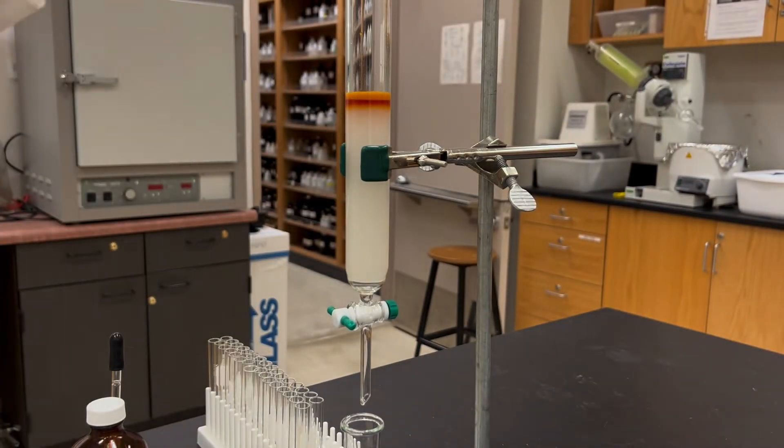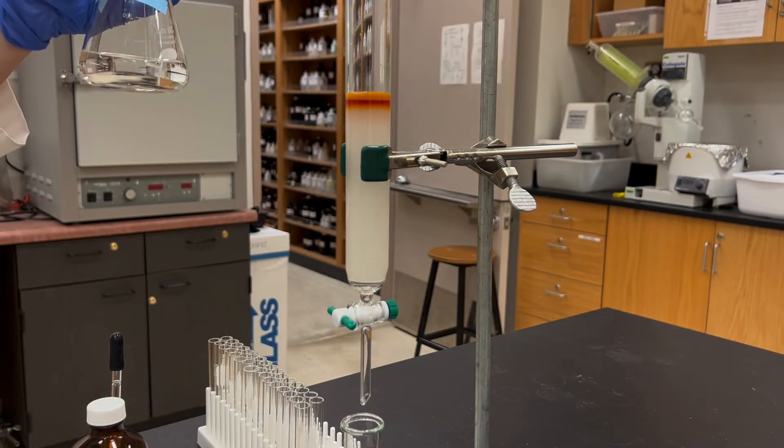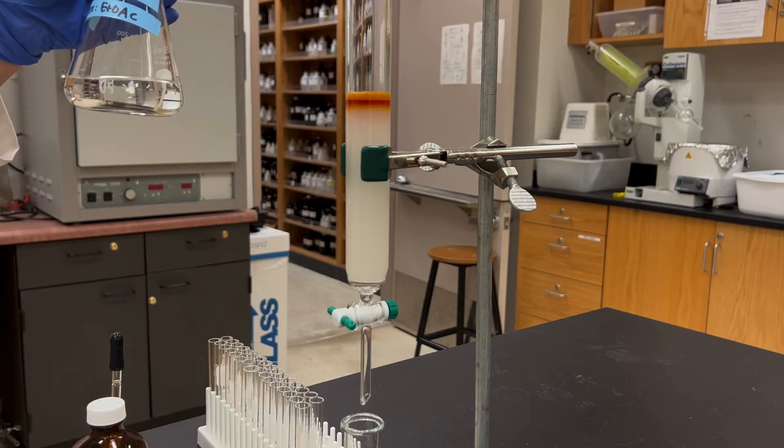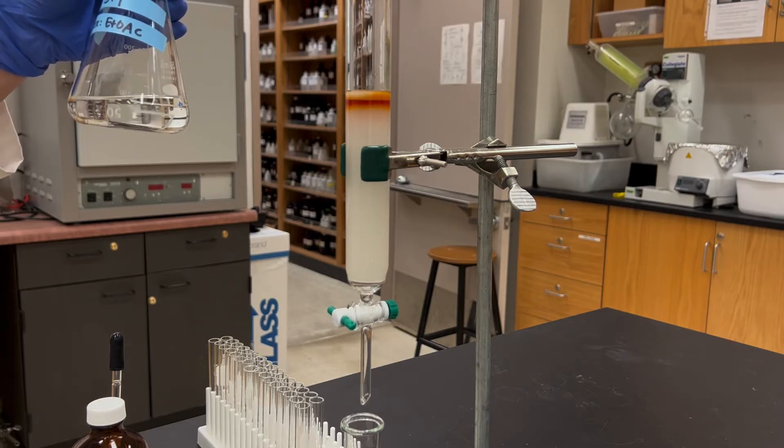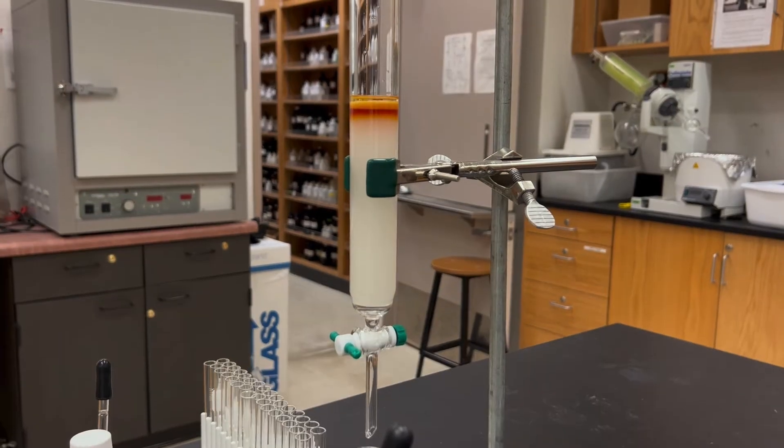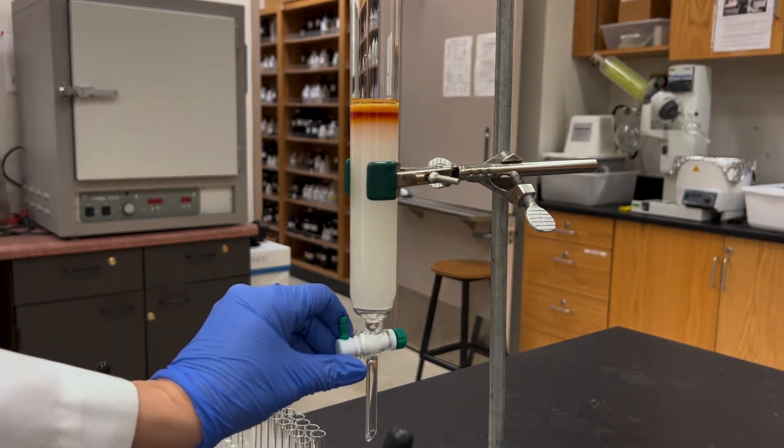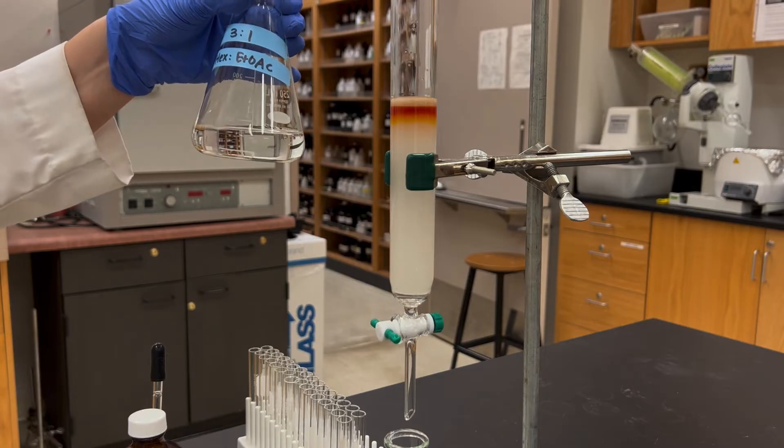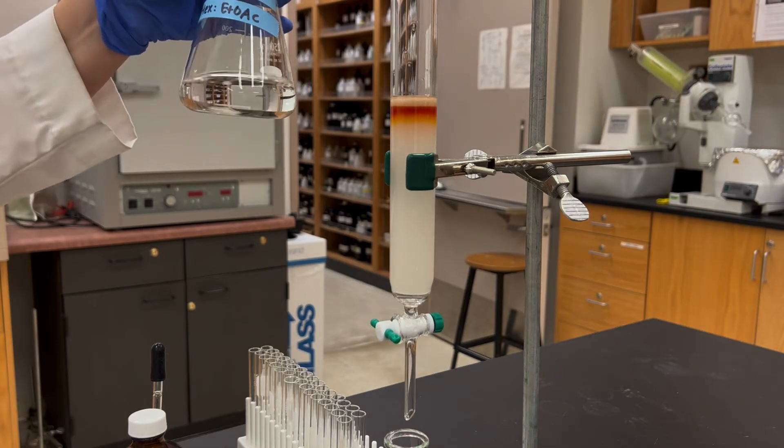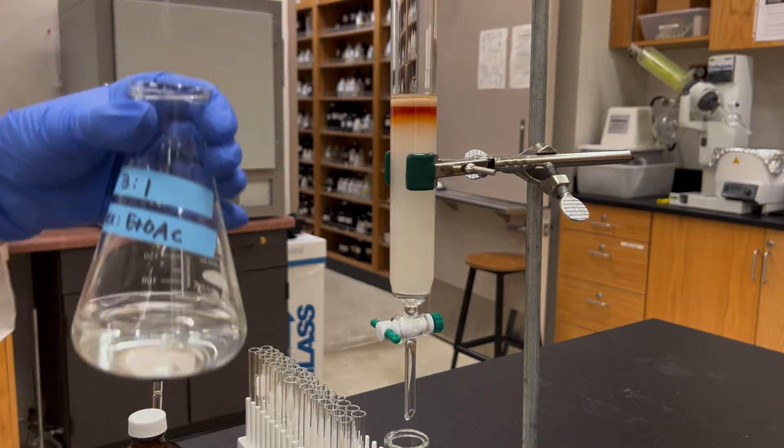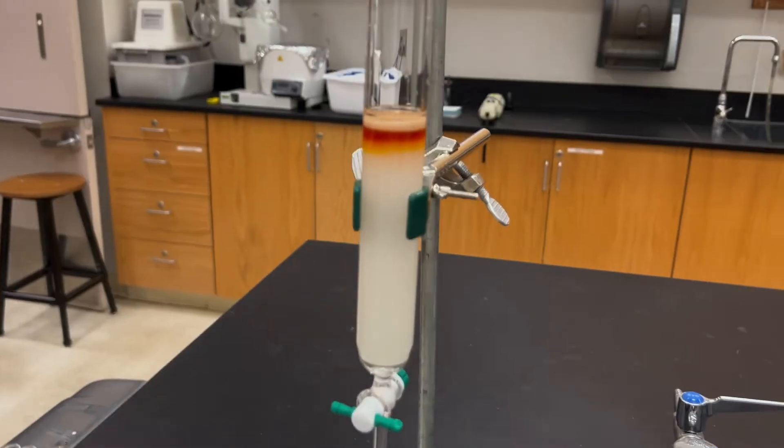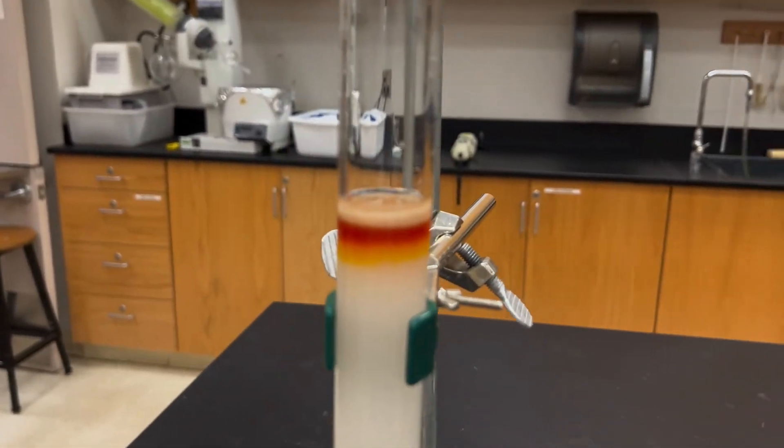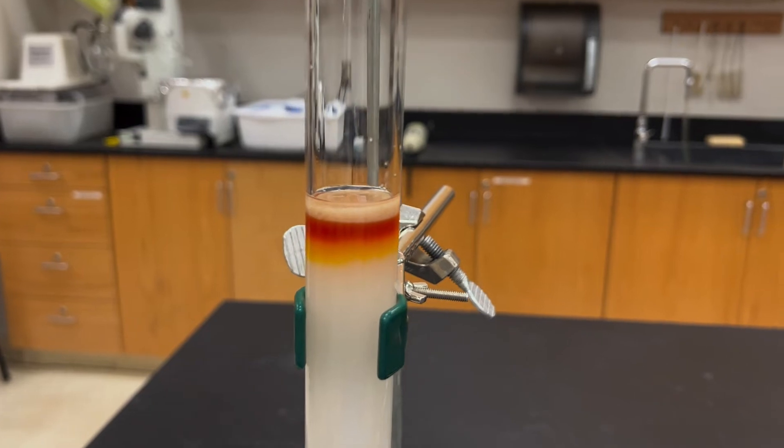Next I'll add some solvent to do a rinse and I'll be again really careful about how I add this to the column. I'm going to drip the liquid down the sides, rinse it down the sides, and then I'll again open up the stopcock and let that drain until the liquid just goes past the sand layer onto the column. I can do it a second time if I feel I need to and again let it drain until the liquid is right past the sand and to the top of the white part.